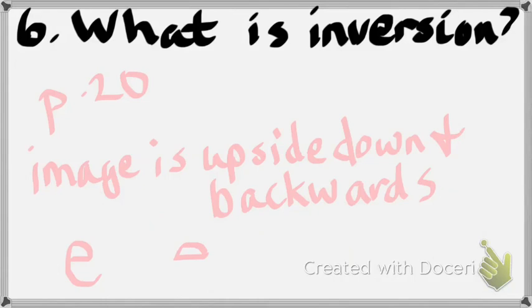Okay, does your letter E look like that? No, that's not right, because all I did was flip it right to left. Yeah, I've got to go upside down as well. Okay, so this is the letter E inverted. The tops become the bottom, the lefts become the right. This one's not correct.